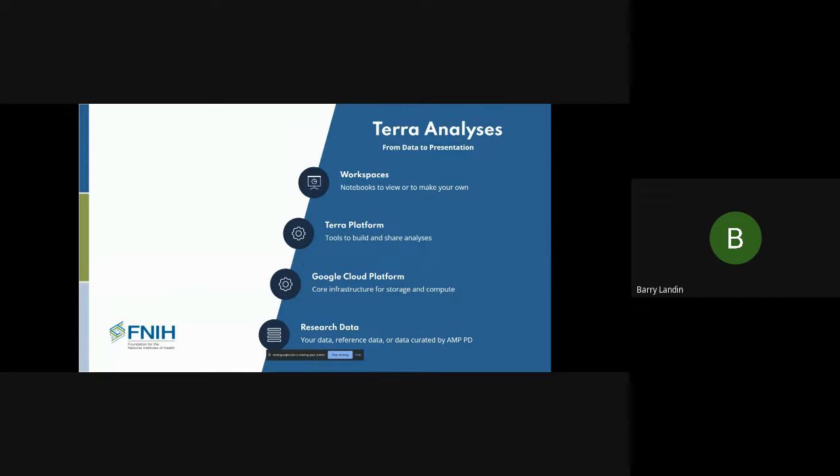In addition to the getting started materials, we've also created some sample notebooks and other examples that show how to actually work with the data together with clinical data or proteomics.